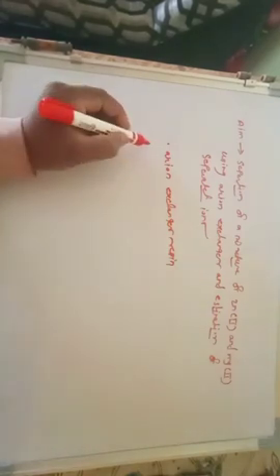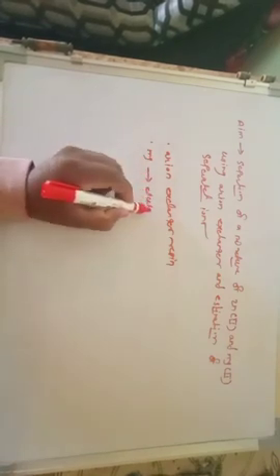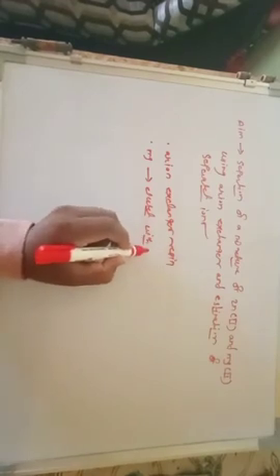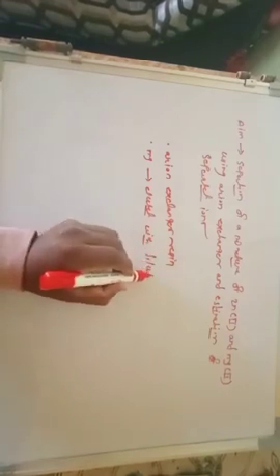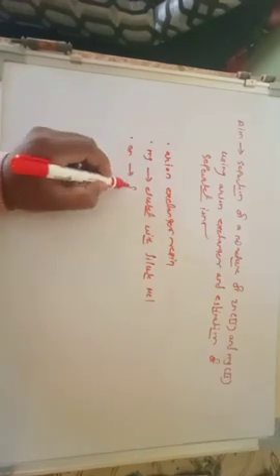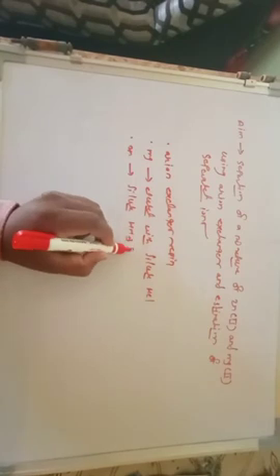Magnesium is eluted with dilute hydrochloric acid solution, and zinc is eluted with dilute nitric acid solution.